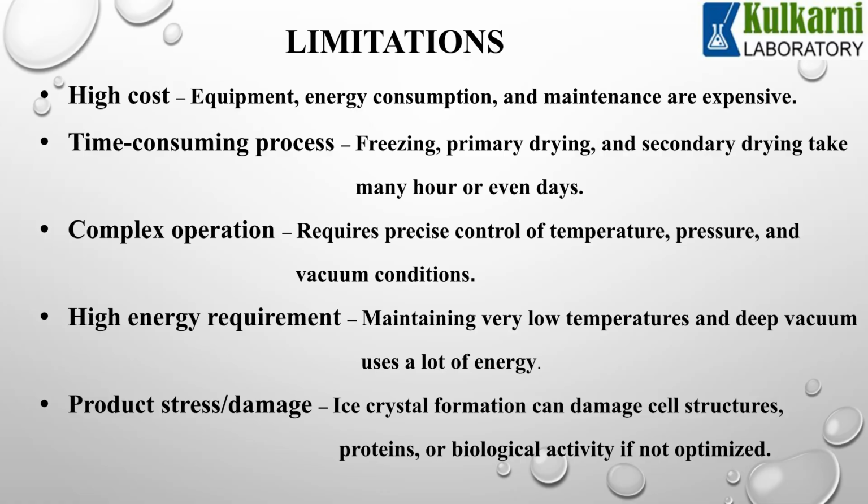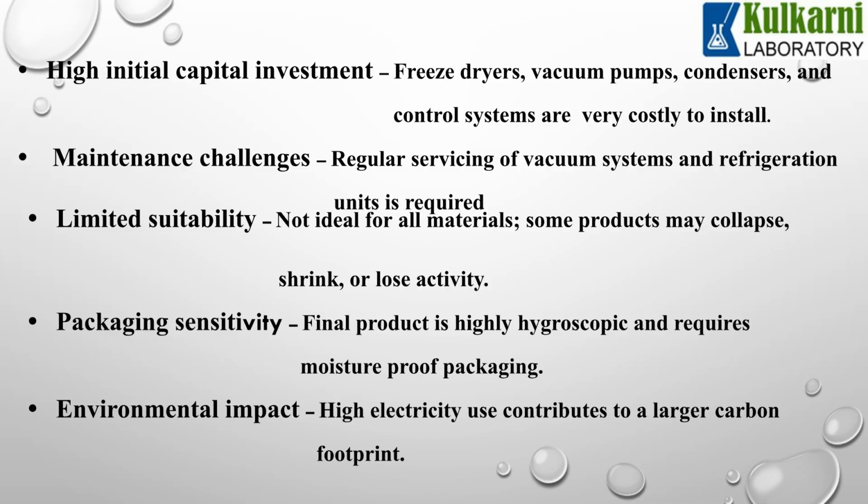Despite its advantages, lyophilization has limitations, including high costs for equipment, energy, and maintenance. It is also a time-consuming process, and its complex operation requires precise control of temperature, pressure, and vacuum conditions. Other limitations include the high initial capital investment and ongoing maintenance challenges for specialized equipment. Additionally, the process is not suitable for all materials and has an environmental impact due to high energy use.